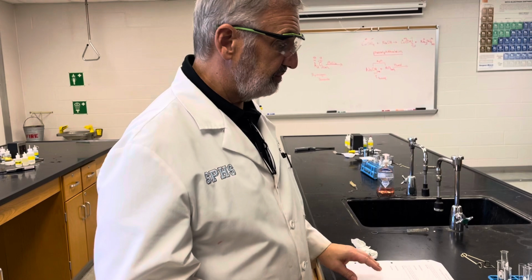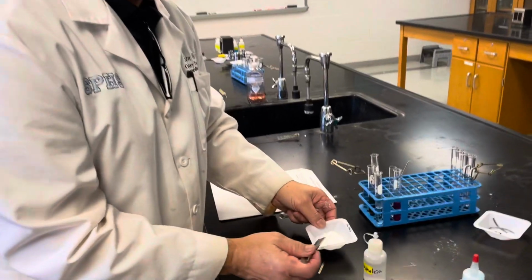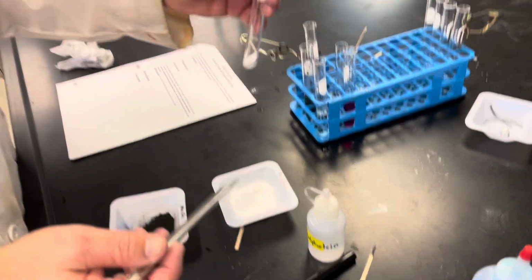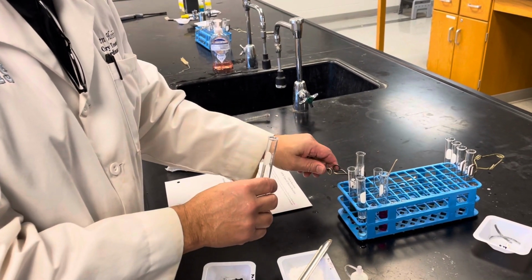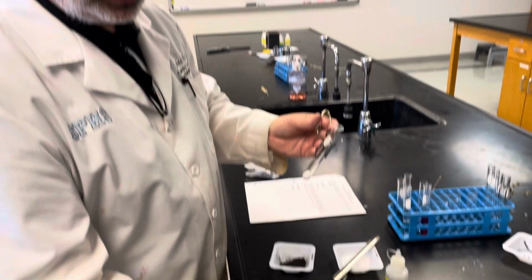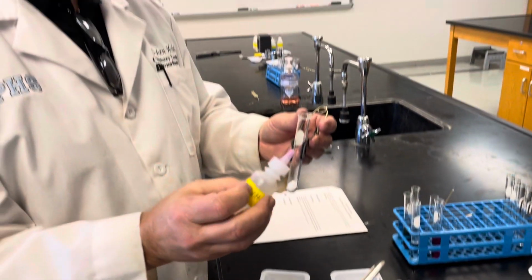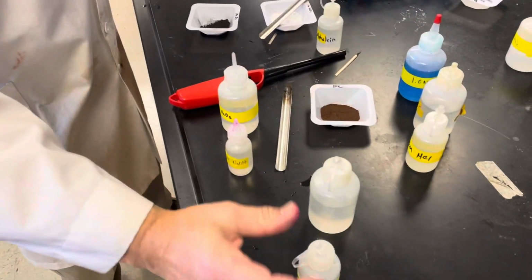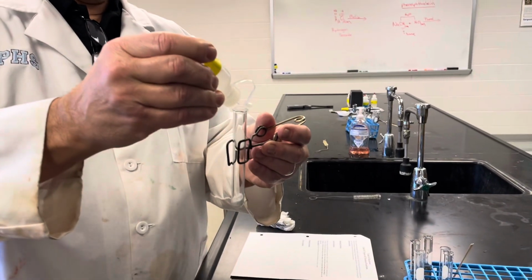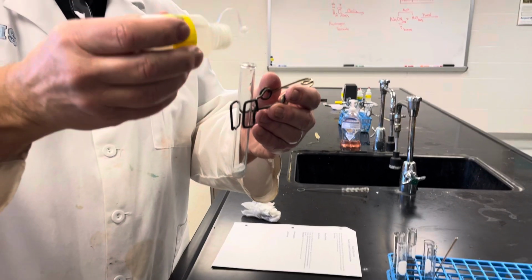And then lastly, we're going to take some sodium bicarbonate. And we're going to put some sodium bicarbonate into a test tube. Okay? Again, we never want to hold the test tube in our hand. And we're going to take some more HCl. I just put the lid onto it and I didn't need to. Oop, that's NaOH. We always want to read the label first. And when I go to put the HCl in, this is the squirt bottle that doesn't work. Let's try this squirt bottle.